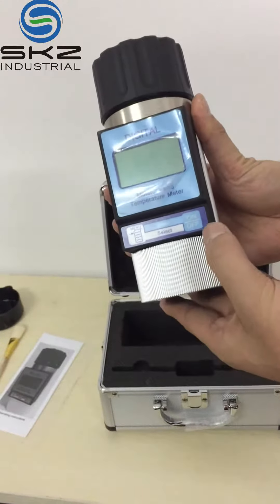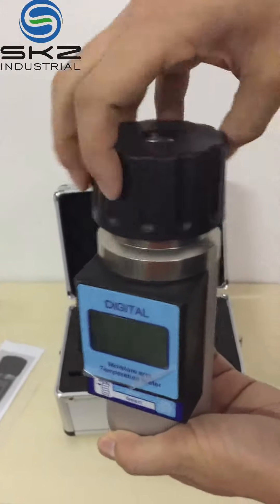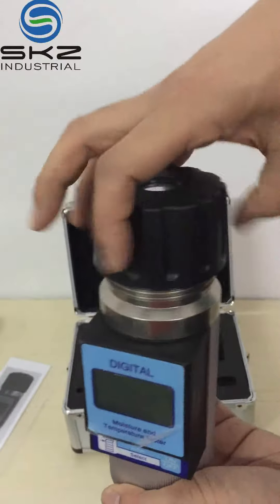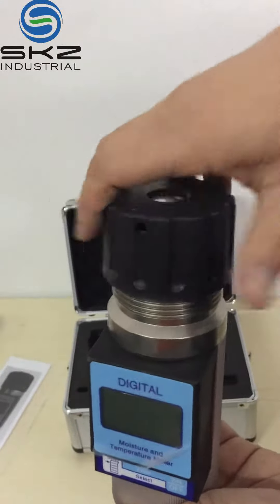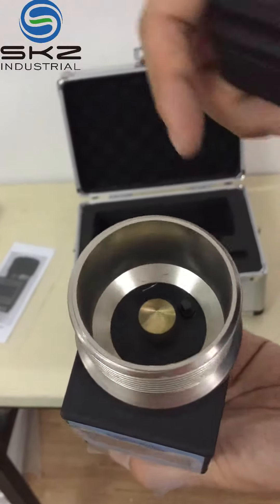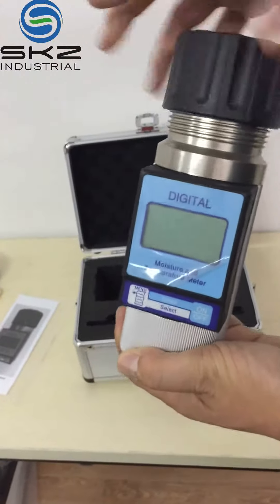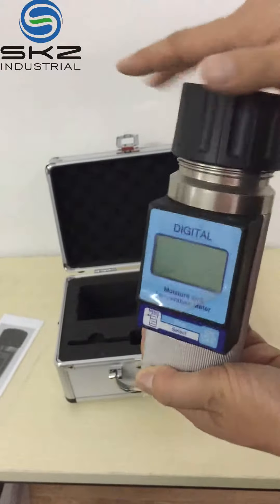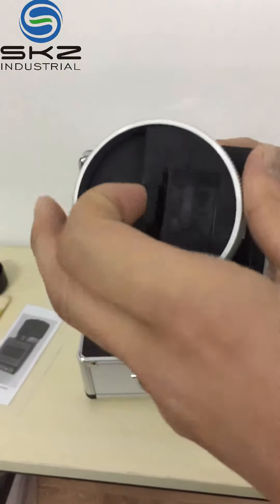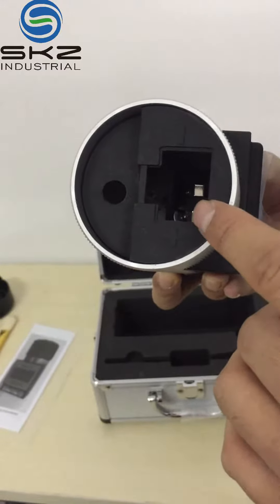This is the moisture meter. Inside, this is the sensor — put the sample here. Here is for the battery; you can put the battery inside. 9V.